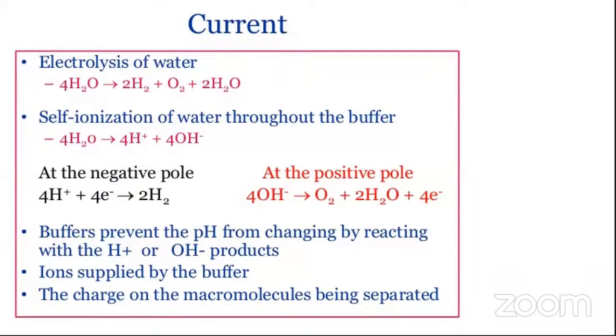Will the current, now we understand current as the number of charges reaching the electrodes. And during electrophoresis, we don't allow our molecule of interest, which is the charged entity, to reach the electrodes, right? We have to stop it before it reaches the electrode. So then, will this direct relationship of voltage with current still be obeyed? Is it a fair question to ask?